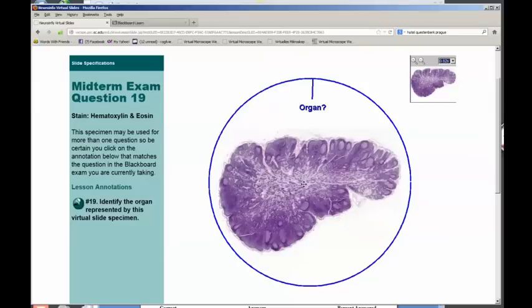So it reminds me of cortex and medulla, and this must be a solid organ, one with cortex and medulla. So what are the solid organs that have a cortex and medulla? Well, there's the lymph node and the thymus. Those are two that I can think of right away. And of course, you are studying right now, I think, kidney. It has cortex and medulla. But of the organs you studied before, the heart doesn't have a cortex and medulla.